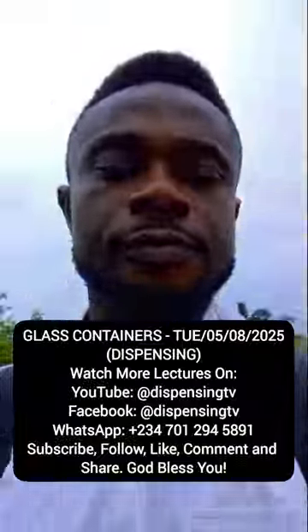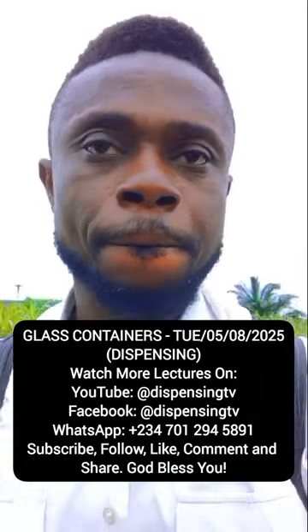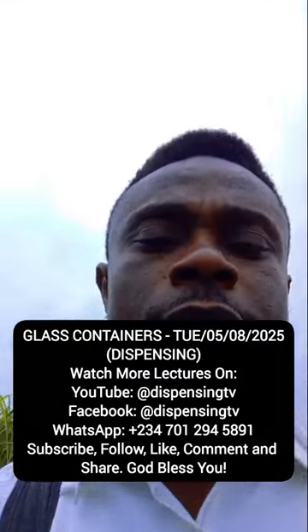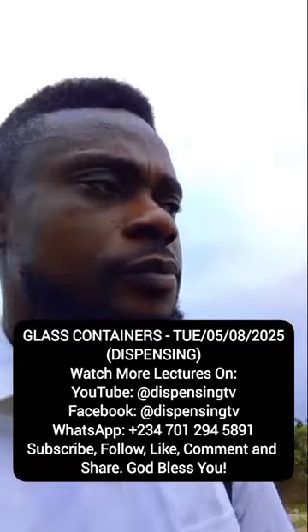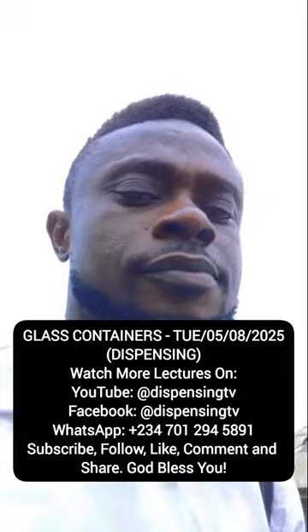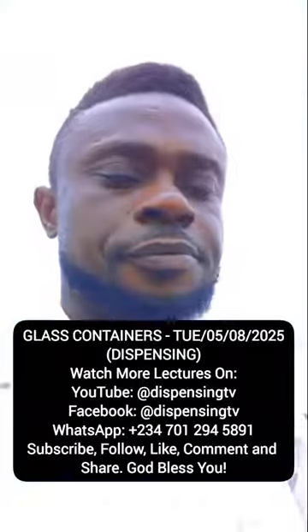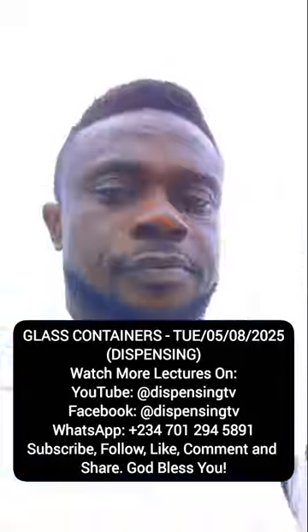The reason for that is to ensure that all the liquid gets down to the bottom part. Is that clear? Then when this is done, you hold the bottom part with the color dot facing you. The color dot should be facing you, not this side. Then you put the other hand on the top of the ampoule. You have done like this, all liquid would have gone down.